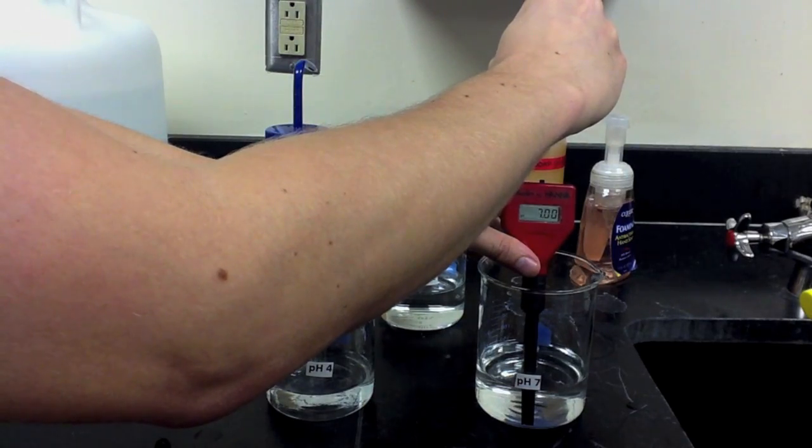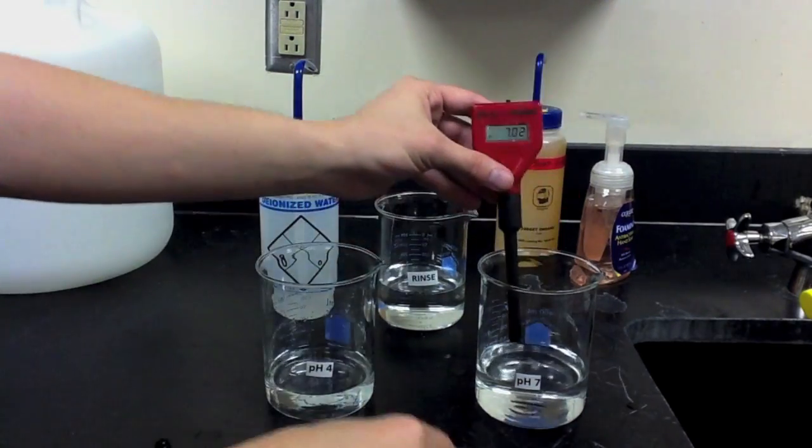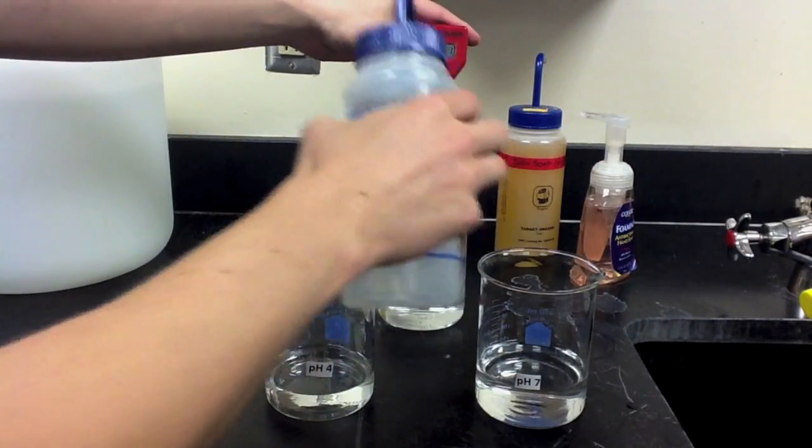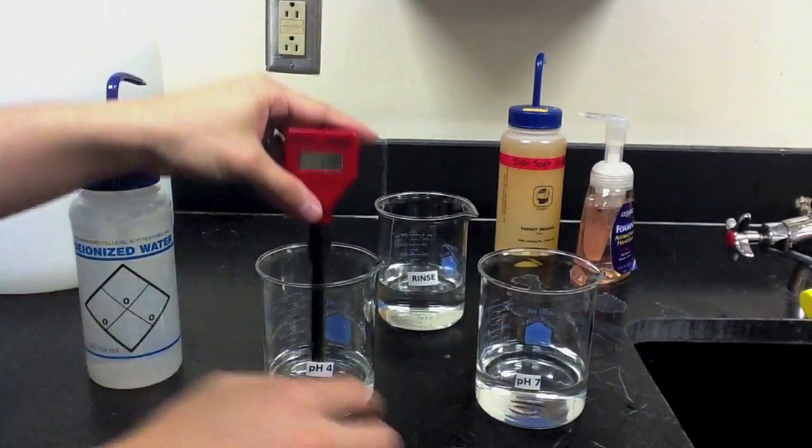Once we achieve a pH of 7, we're going to rinse the electrode and after rinsing, we can then place the pH meter into the pH 4 buffer.